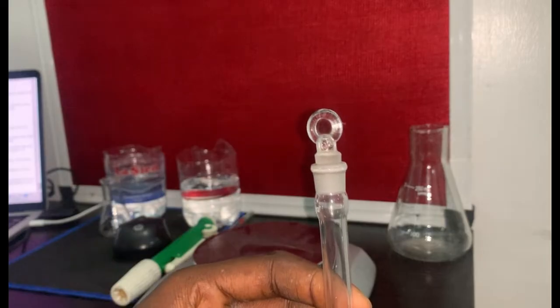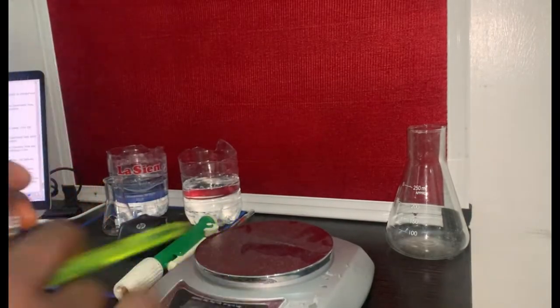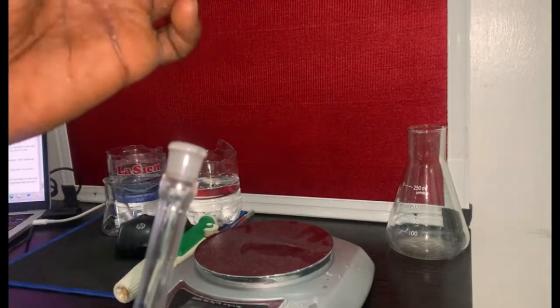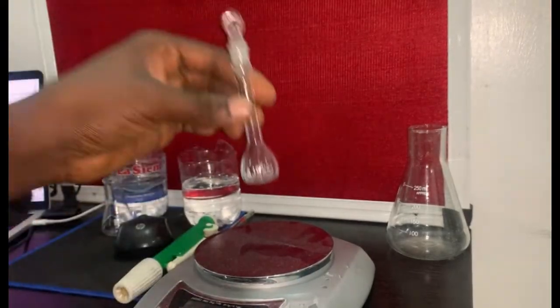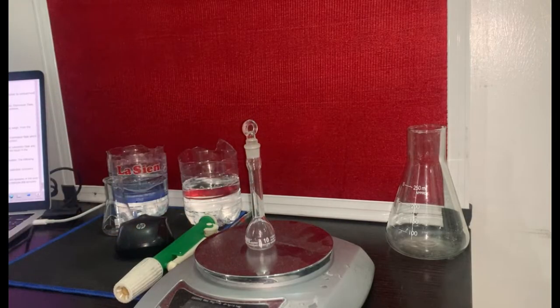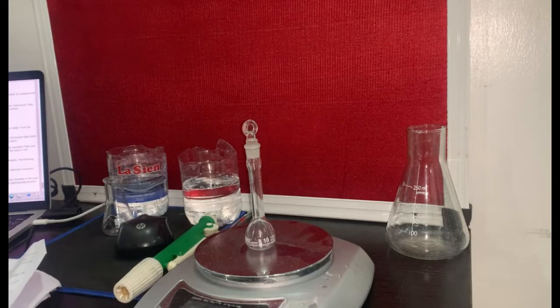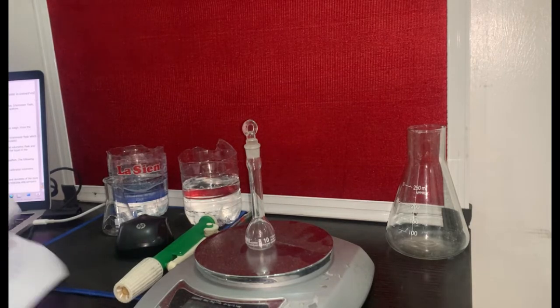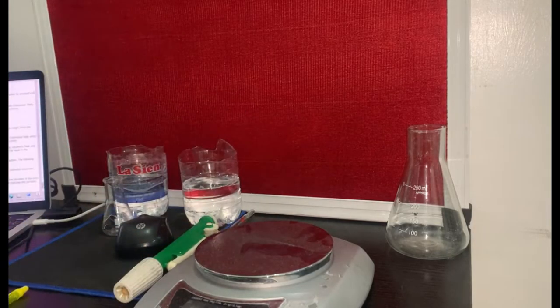The instruction we are going to follow says we weigh this flask when it is empty, with the stopper on top of it. So I'll put this on my weighing balance. The mass of the empty volumetric flask gave me 16.5 grams. Where exactly are we going to record that? Of course, in your data table to be displayed on the screen. Now, I'll bring it out.